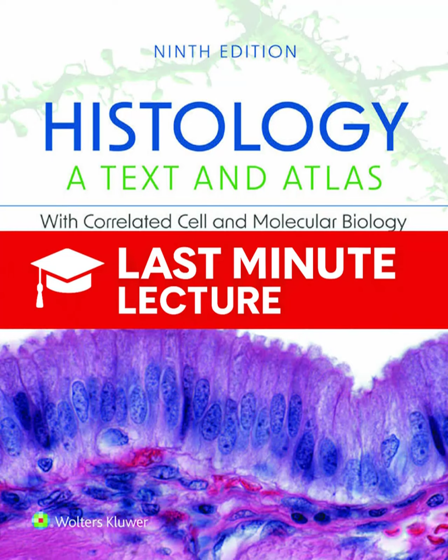Right, figure F1.1.1 shows a great comparison. The frozen section stained with methylene blue might not have the beautiful, subtle color contrast of a full H&E prep, but you can see what you need to see. You can see the cellular architecture and any obvious pathology, like tumor cells invading. That rapid diagnosis is a critical, time-sensitive piece of communication between the pathologist and the surgeon.